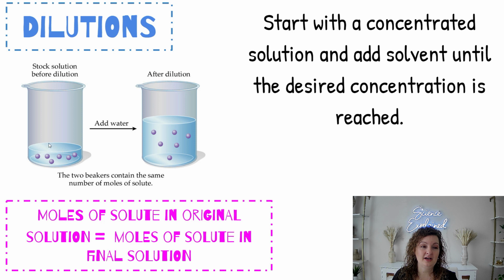So you can see that's what's happening here. This is our stock solution. It is concentrated. We add water. In this case, this is our solvent. And it becomes not only an increase in volume because we added that solvent of water, but it will become more diluted because now we have less solute for our solvent.